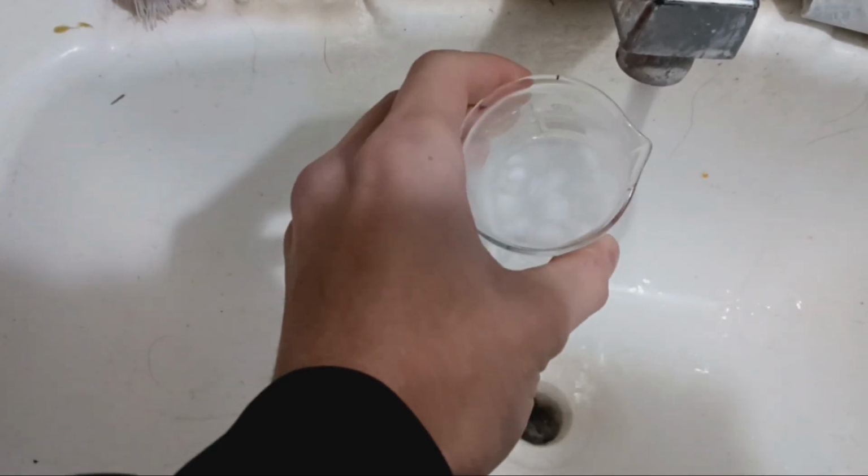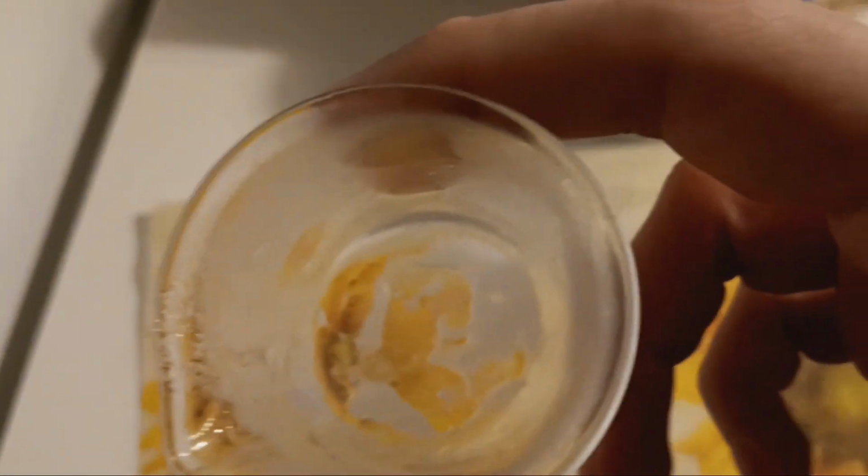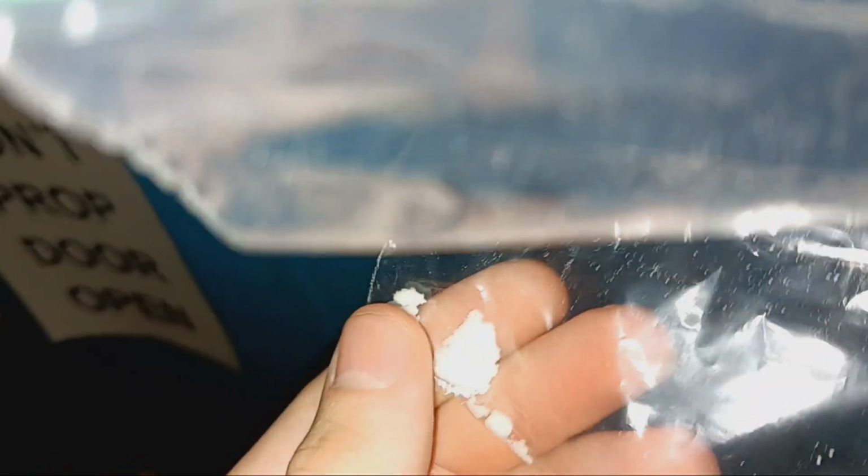This white powder that is dissolved in the water must first be thawed out of the ice, then dried, leaving a white powder. It was fluffy, vaguely similar to what I've seen images of sodium hydroxide powder looking like. There was not very much of it, and it did not remind me much of salt, so I believe I have successfully finally produced sodium hydroxide in a very trace quantity, however.